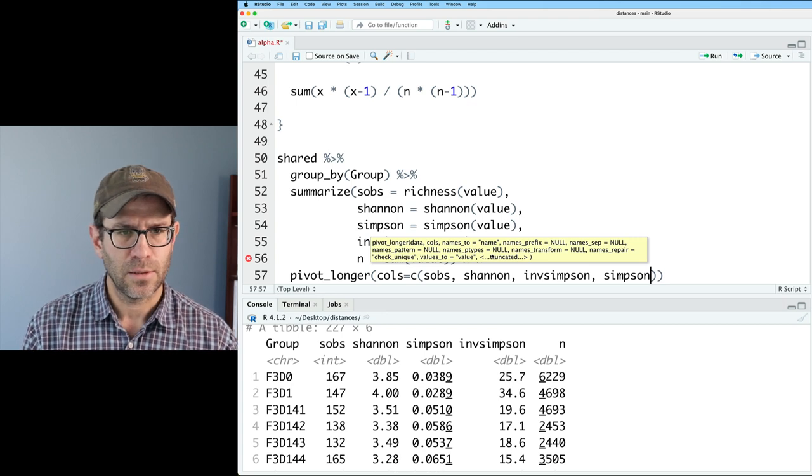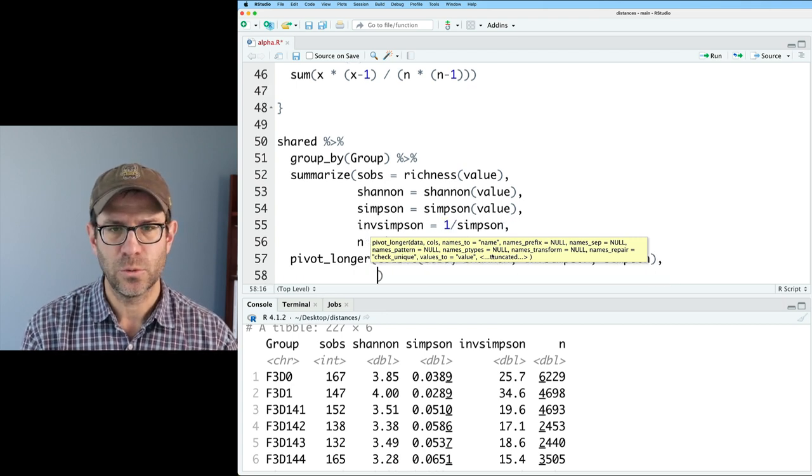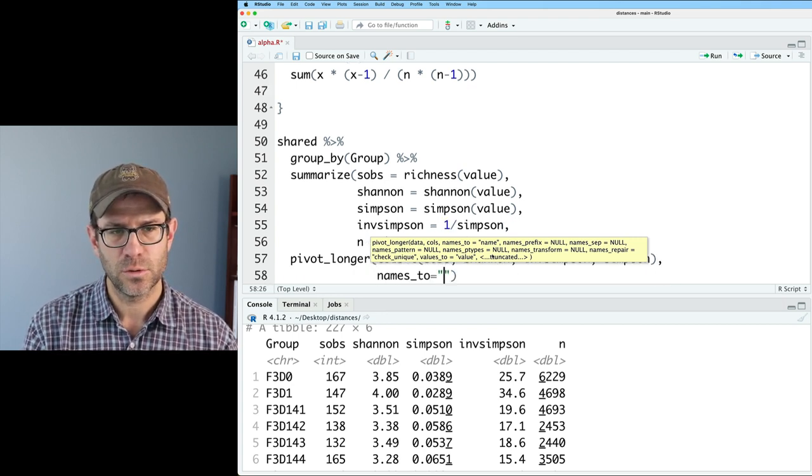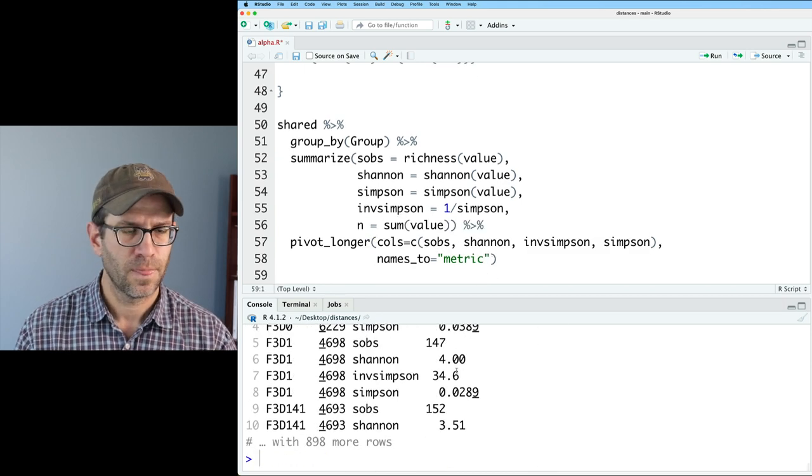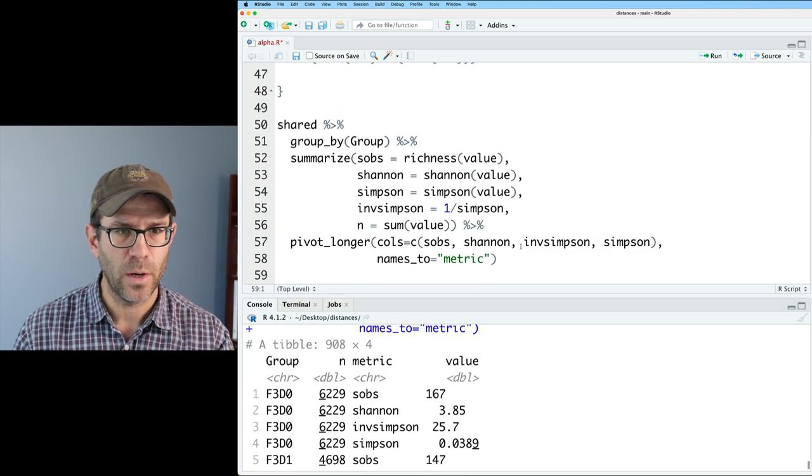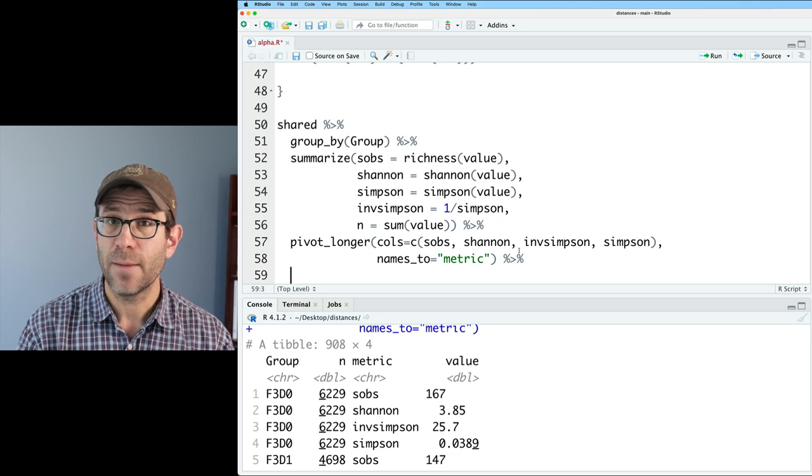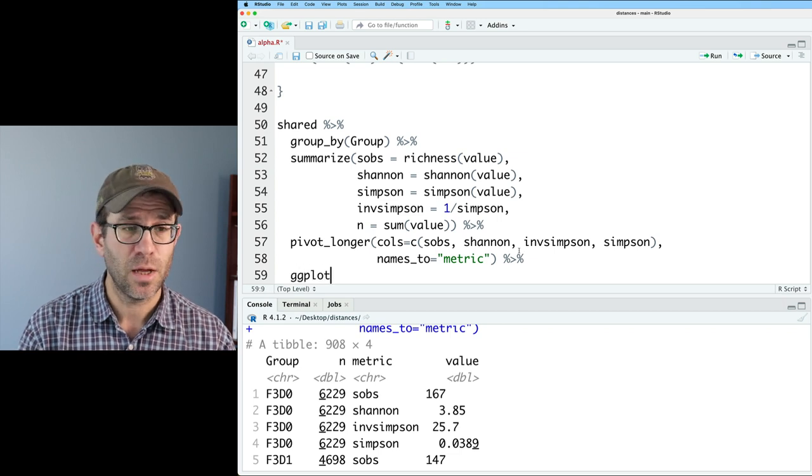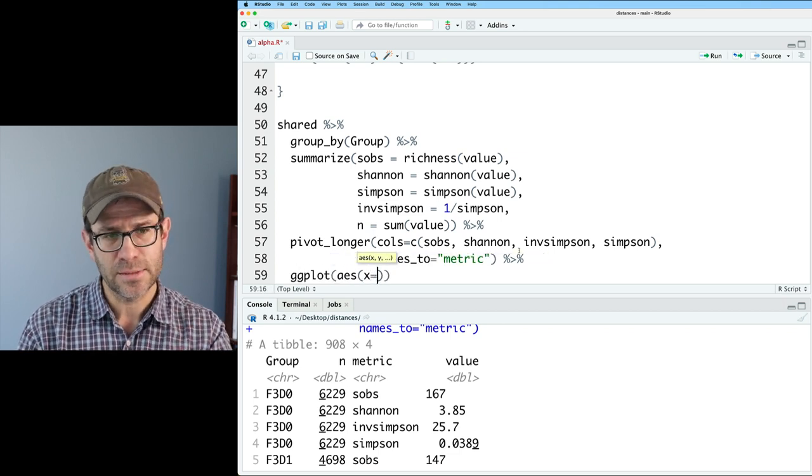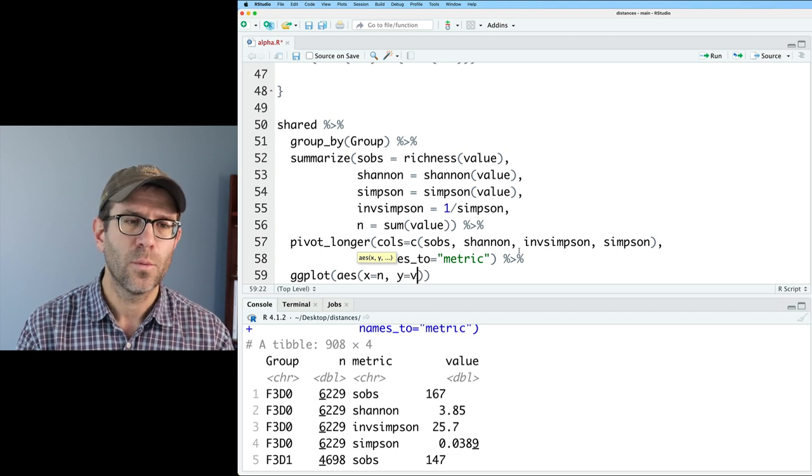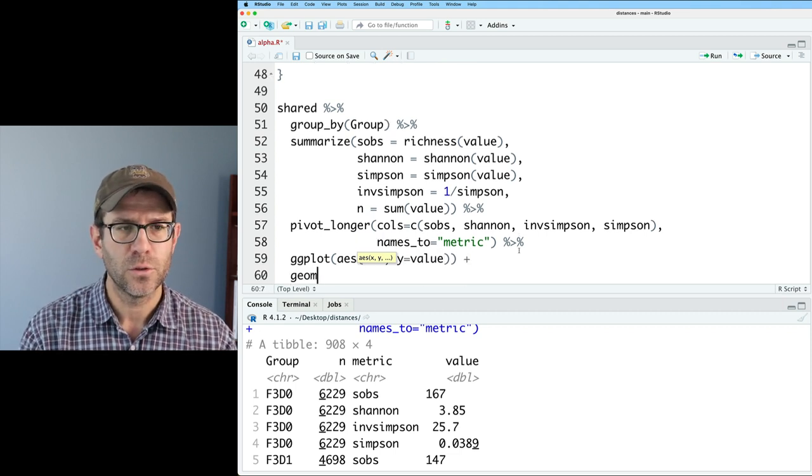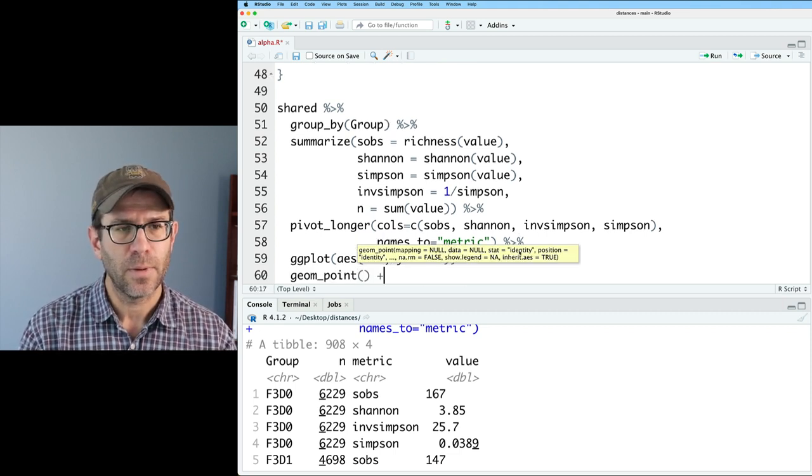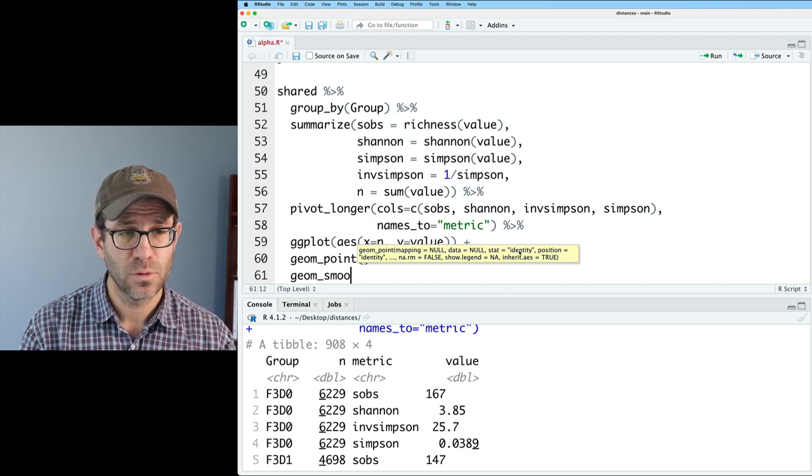I think that all looks right. And then we will do names to be metric. And so we've got that pivoted longer quite nicely. And then I will pipe this to ggplot aes. So on the x axis, we want the n on the y, we want the value, we're going to do a geom point. And I'm also going to do a geom smooth.